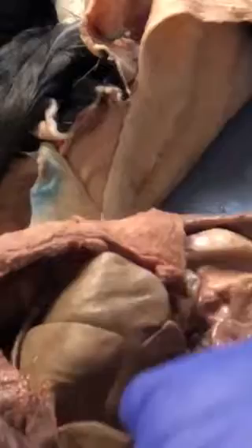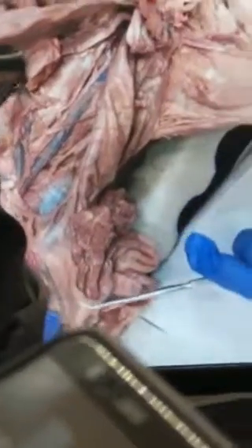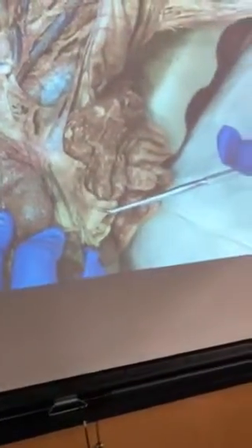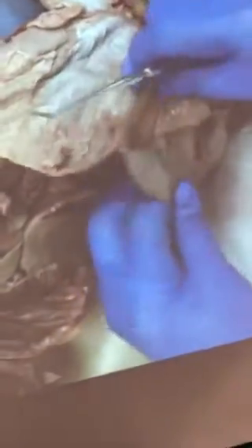There's the spleen. Now, those are the ones you need to identify. Of course you know what the italic structure is. For the different layers of the abdominal wall: the thickest, darkest one is the transversus abdominis; the outer one is the external oblique; and the middle one is the internal oblique. You can see that there are distinct layers.